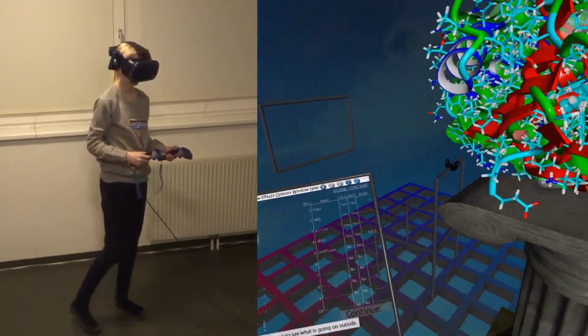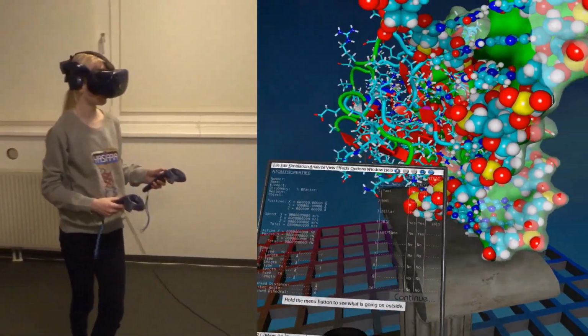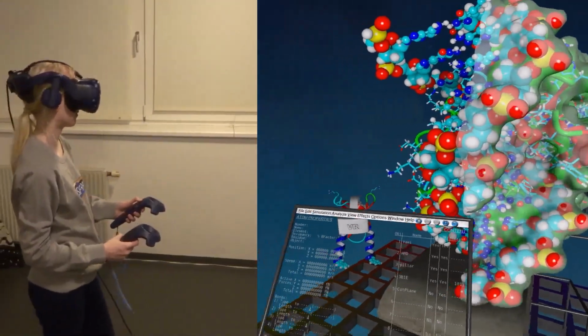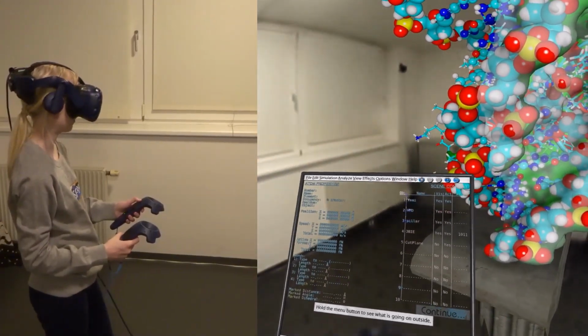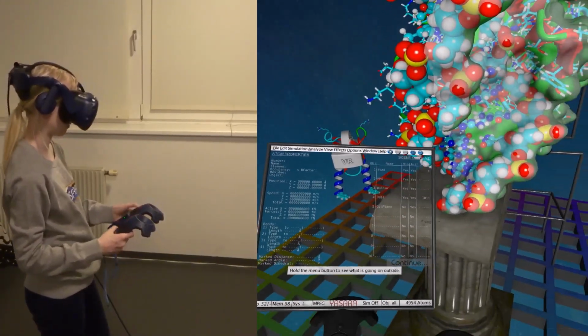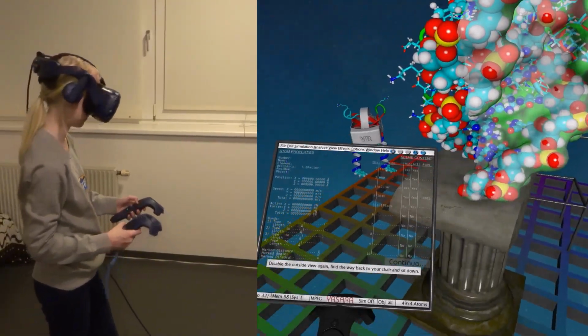If you want to know what is going on in the real world, keep the top button pressed to activate pass-through mode and have a look. Some headsets require to double tap on their side instead. Finally, sit down again.